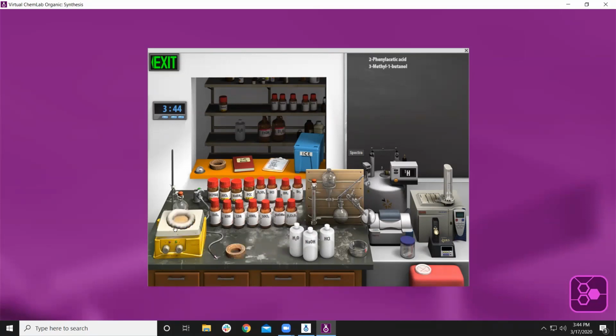So I'm going to go add heat. I want this to go faster, and I'm going to go add a condenser. And so, oops, I missed. I could double click, add it as well. I could go add my sulfuric acid here. And now I've added my acid.